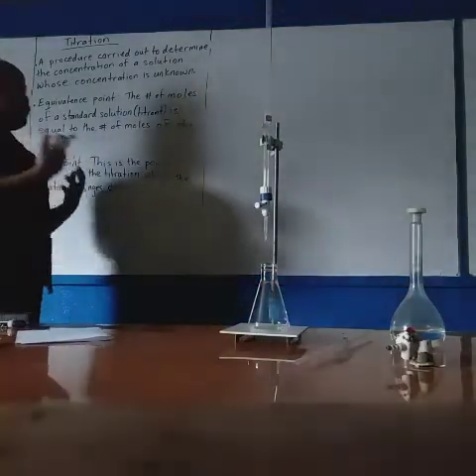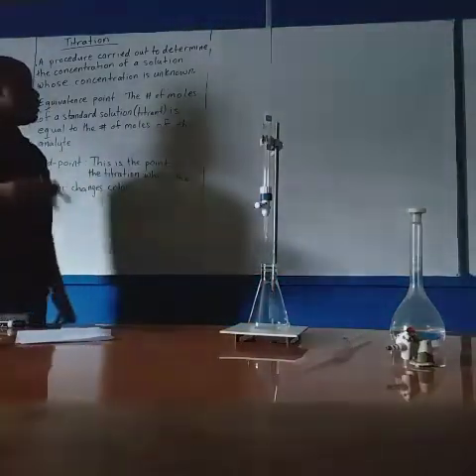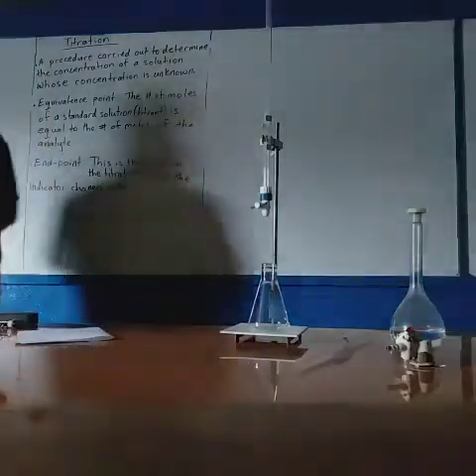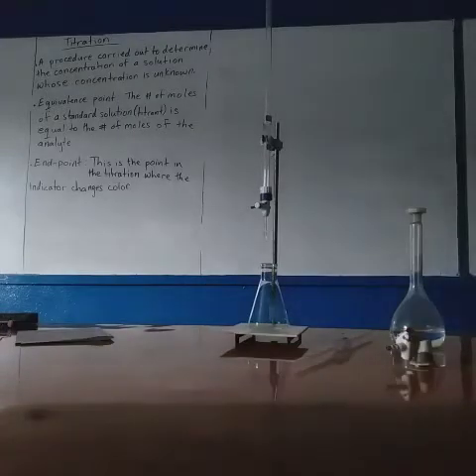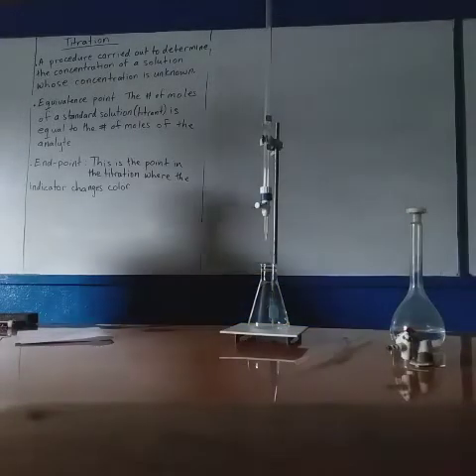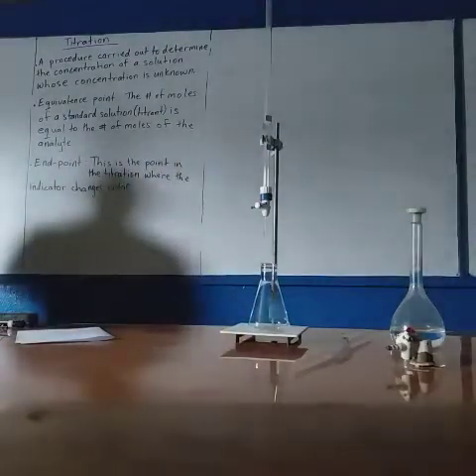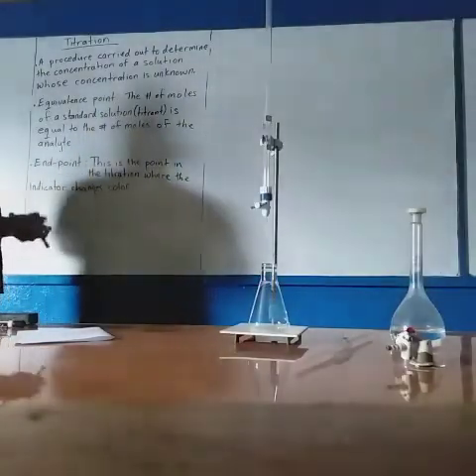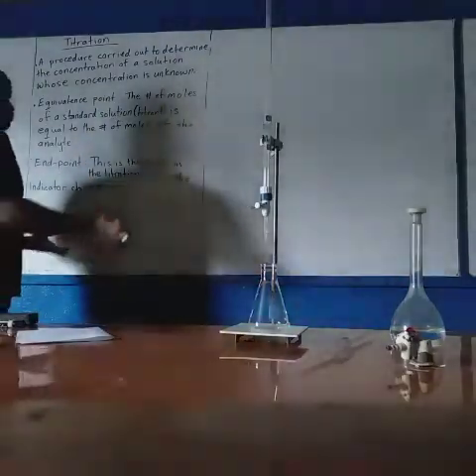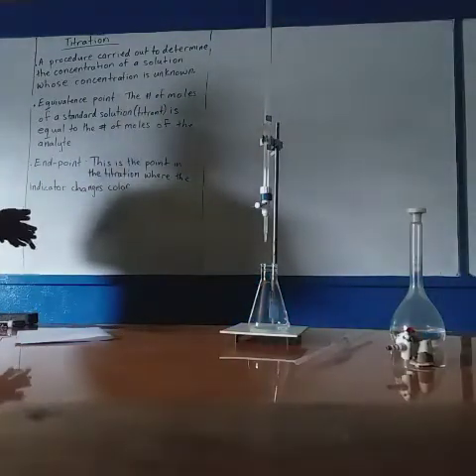So basically, it will not be a standard solution. Because remember, we said a standard solution is a solution whose concentration is known. So if you don't know the concentration of a solution, one way of finding it out is to do a titration. Now there are different types of titration. You have acid-base, redox, back titration, and others. But for this one, we are focusing on acid-base titration.